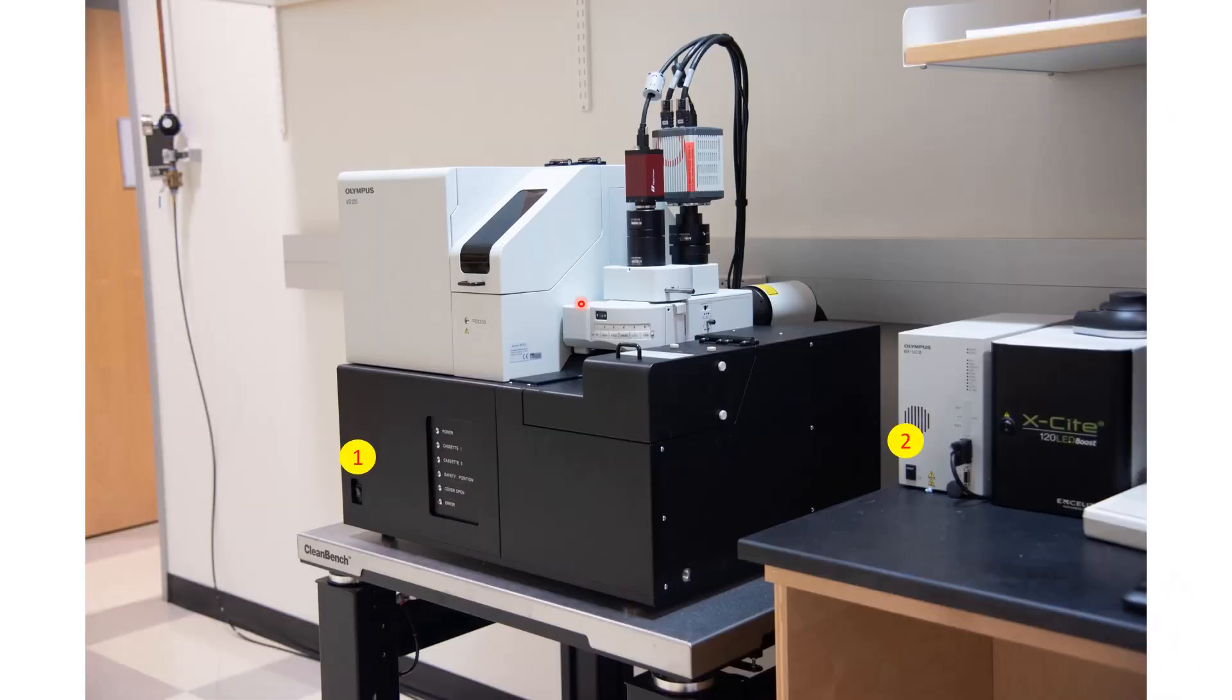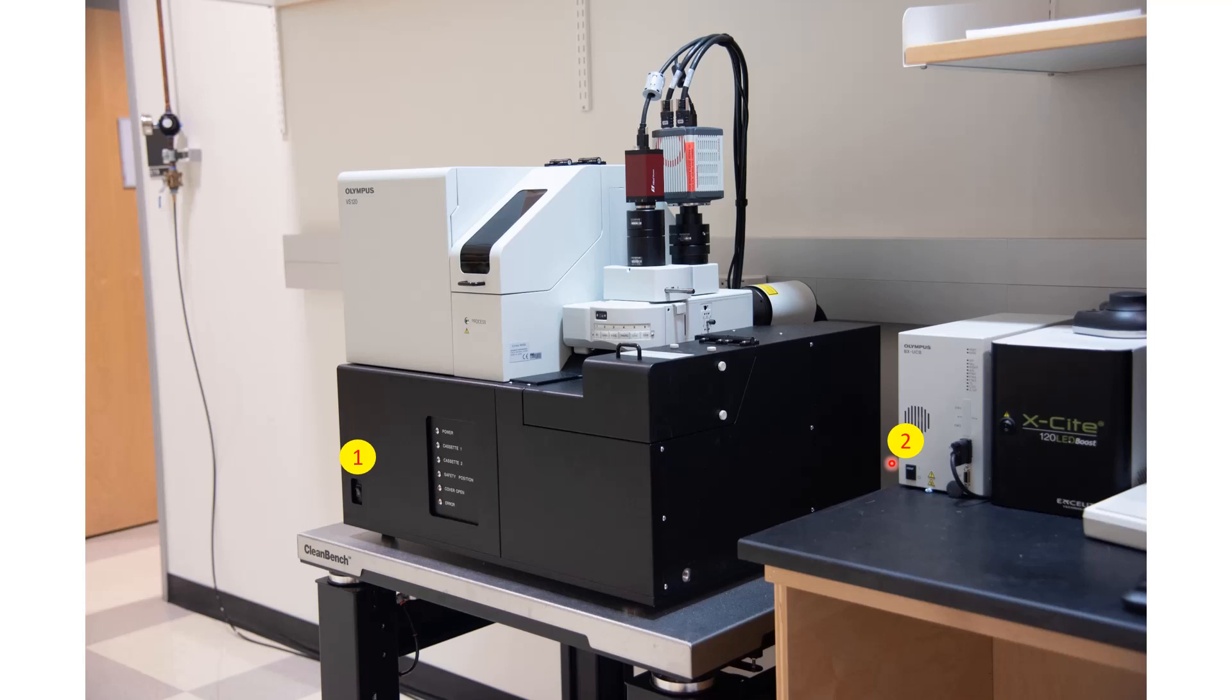To switch on the microscope, the first button is here. There's a power button and number two is the brain of the microscope, which is here. Next, you can switch on the CPU. In case you are doing fluorescence imaging, you will be needing to switch on a few more switches, which we'll be covering in module number two. But for now, you can just switch on these two buttons and the CPU.